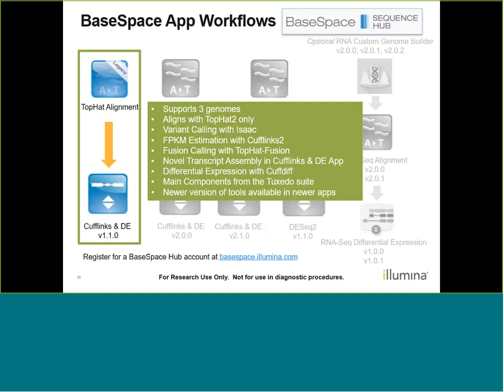This workflow, as mentioned, is our legacy workflow. So if you're coming in new to RNA-Seq analysis, we would recommend using a newer version of the tool. However, this is intended for anybody that's continuing experiments that may be using these particular suite of tools.